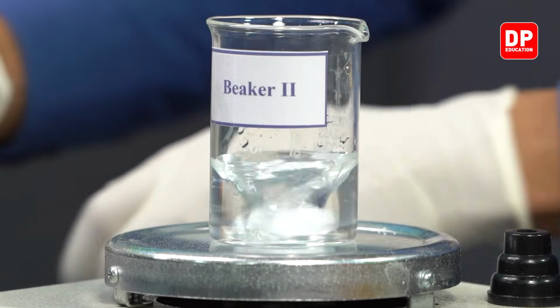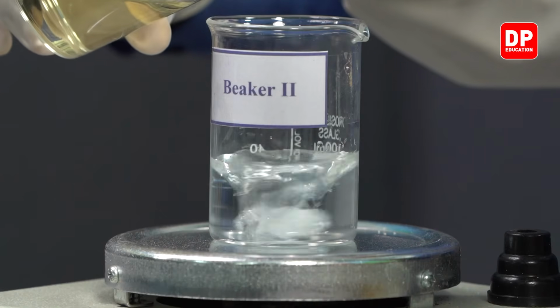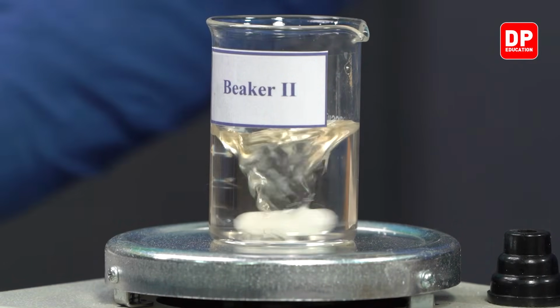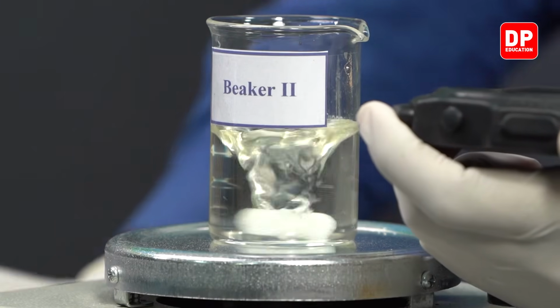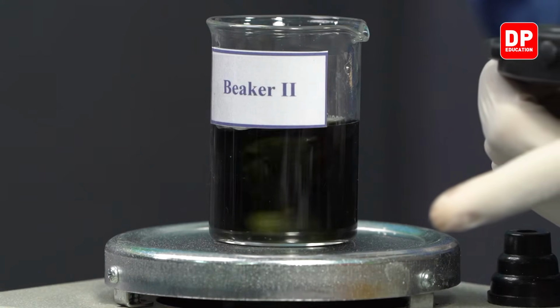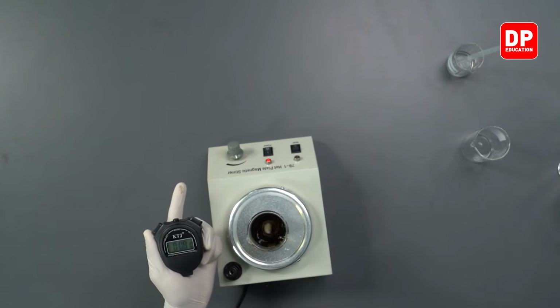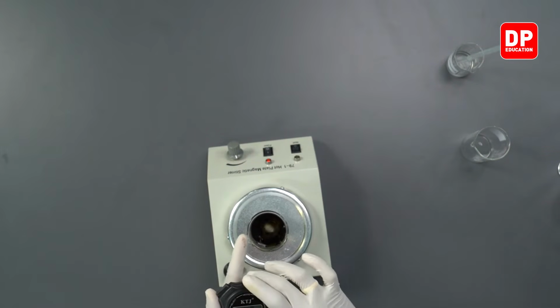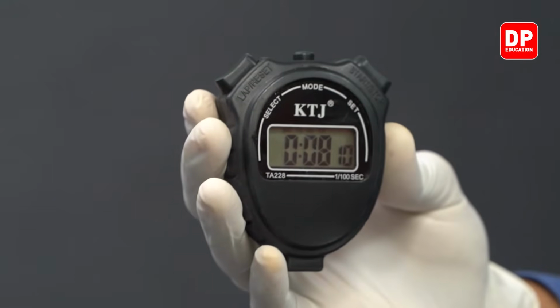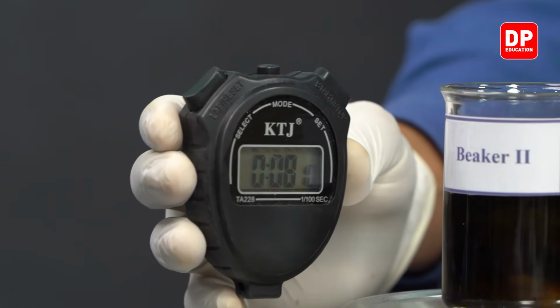So students, when you are adding contents of beaker 1, which is Fe3+ ion, as soon as you add it, turn on your stopwatch. So we started the stopwatch, and as soon as you see a color change, we need to stop the stopwatch. I hope you were able to observe the color change as well as the time taken for the color change. So it took 8.10 seconds for this color to be observed. You can see the color change as well as the time here.